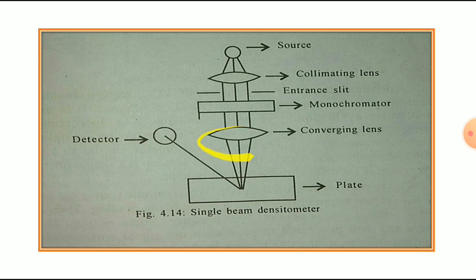See, all directions of that light fall on this single spot, or can focus just like our torch. That single light falls on a particular single point, and the plate will be totally scanned through that single point of light. If a sample component is present on that plate below that light, it will produce a particular output signal.